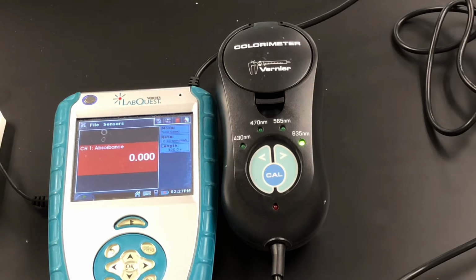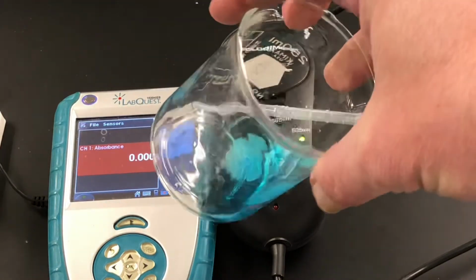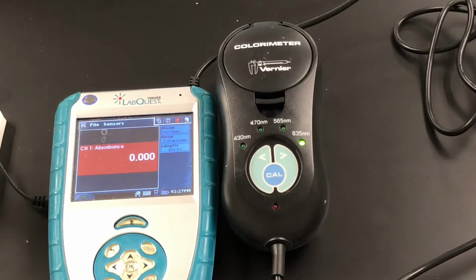So now what we want to do is get our curve. Remember that we need a curve so that we can find y equals mx plus b, and so we have to have some known concentrations. It's going to be up to you to first come up with how we would make this original solution. The directions say you're supposed to have 40 milliliters of a 0.4 molar solution. I already made 40 milliliters of a 0.4 molar solution, so there's not 40 here because I've already made some of the following solutions. You'll notice that there are 5 different test tubes that we're supposed to mix up.